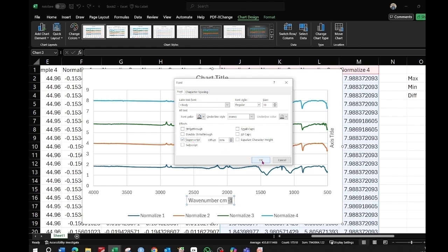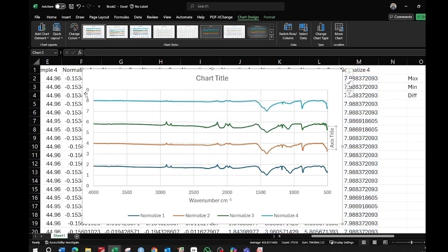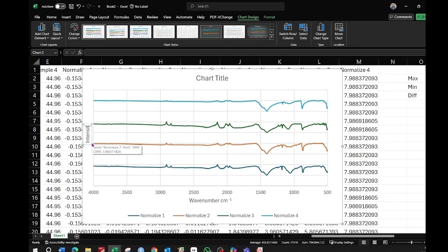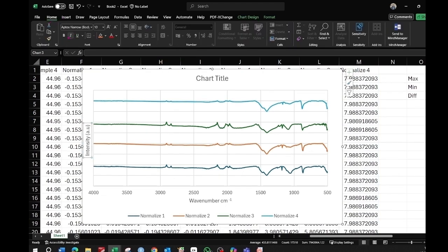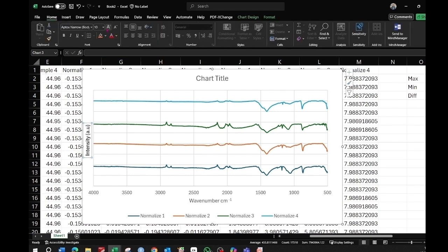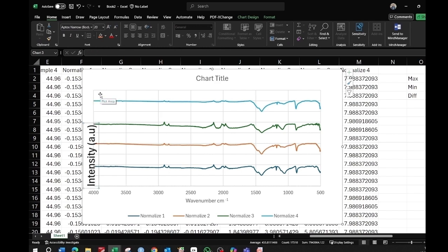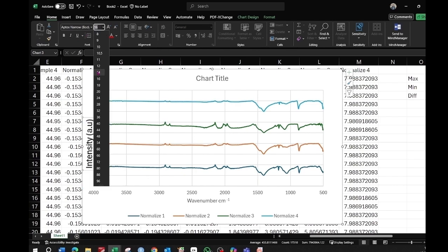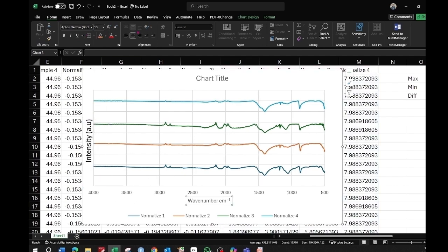For the y-axis, delete the auto-generated values using the Delete key since we don't need them. Drag the axis title to the y-axis, double-click it, and insert 'Intensity' with a unit of 'a.u.' Select the intensity text, go to Format, make it bold and black, then go to Home and set the font size to 14.